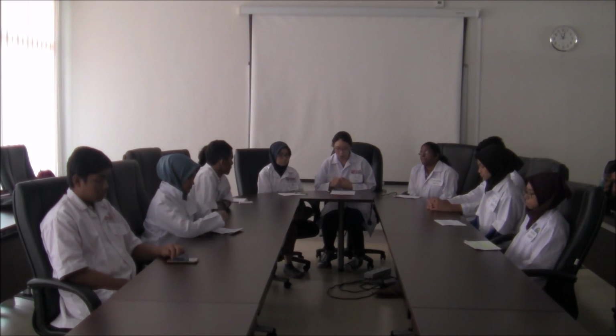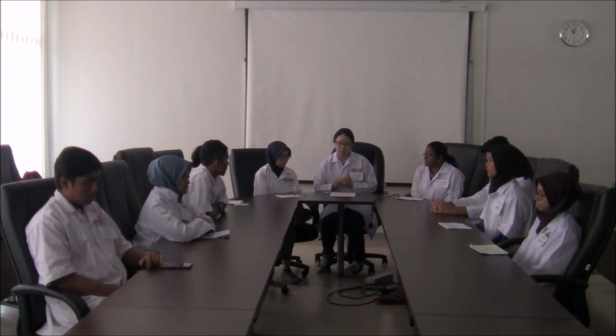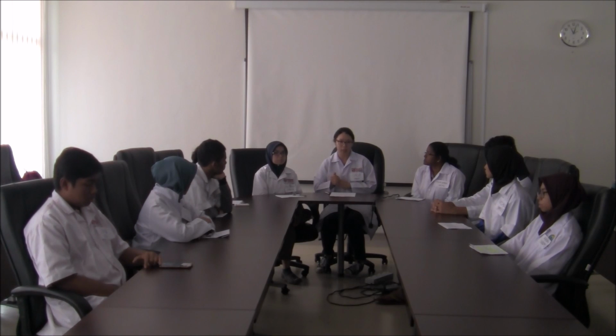And there are two types of spectrophotometer, which are the infrared spectrophotometer and also the ultraviolet, or UV spectrophotometer. Besides, we discussed the absorption spectrum of molecules by a range of colors and the molecular excitation energy. And also, we discussed the functions in bioassays, where it is used for quantitative determination of antibiotic erythromycin by using UV spectrophotometer. Last but not least, we discussed the brief history of spectrophotometry and also the real-life application in the medicine field, where it determines the seriousness of heart attack, measures bacterial growth, color measurement in dosage, and also evaluates effect of different dosage of ingredients in medication.